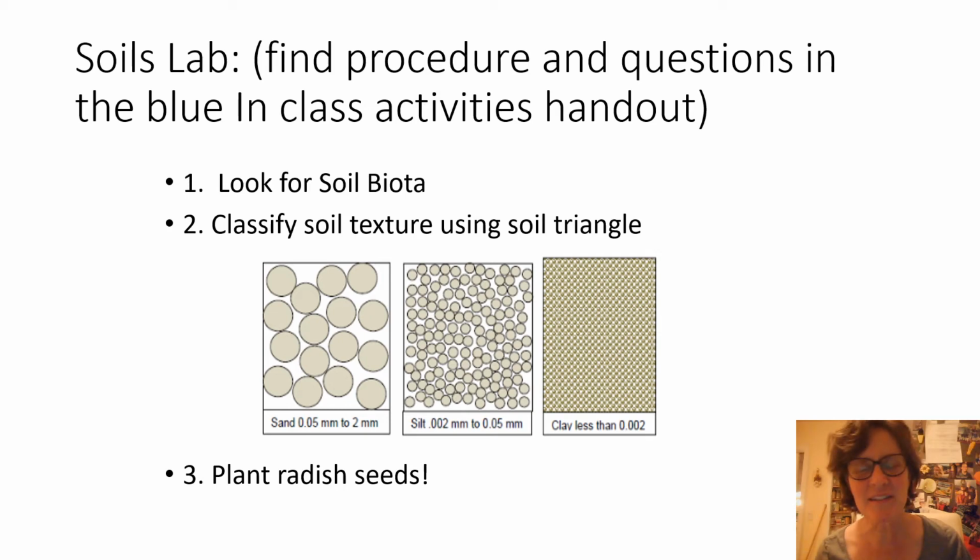Okay, so today we're going to do a three-part soils lab where we'll look at a soil sample that you've collected, hopefully from a relatively undisturbed space like a lawn or a garden that hasn't been dug up recently. And we'll start by looking at living things in the soil. Maybe you have an earthworm or a centipede or some fungi, which will look thread-like.